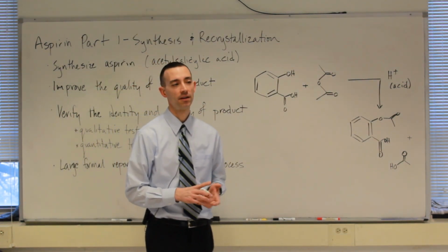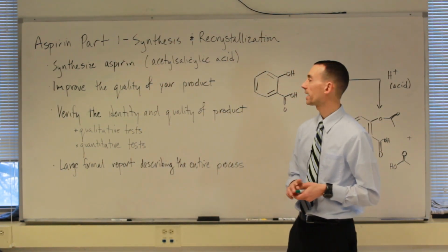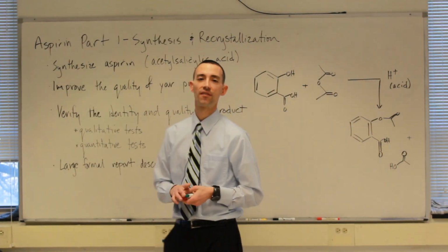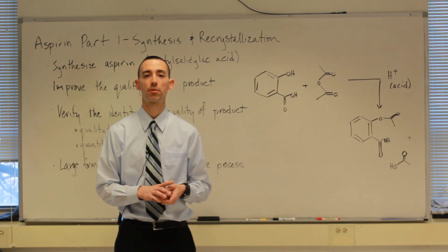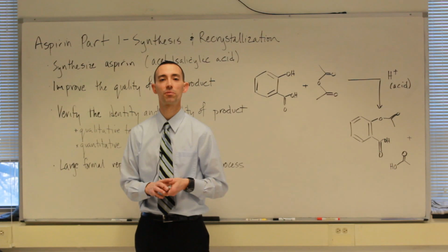This week in the General Chemistry 2 curriculum, we're getting ready for Aspirin Part 1, Synthesis and Recrystallization. This is the first of 3 consecutive labs that we will devote to making aspirin, the same product that you can buy in pretty much any grocery or drug store and many other places.